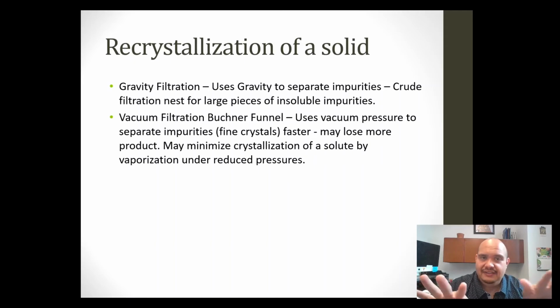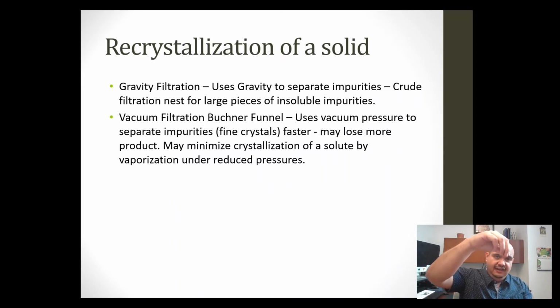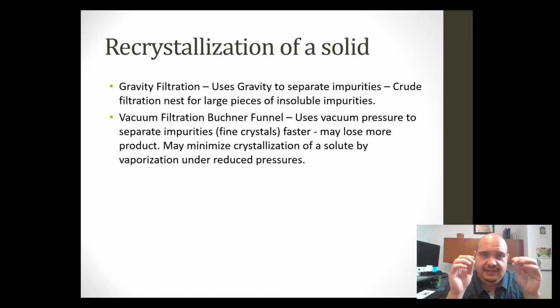If there's nothing solid left over after the rolling boil of your solvent, you can use a vacuum filtration. For the vacuum filtration, you set up your vacuum flask, connect it with a hose to the vacuum line, turn it on, and pour your solvent right through the filter pad. It goes down, the impurities and all the dirty stuff go to the bottom, and your solid crystal should remain on the top. You continue to allow the vacuum to suck out all of the solvent it possibly can, to get your crystal as dry as it can be. That normally takes about 15 minutes.